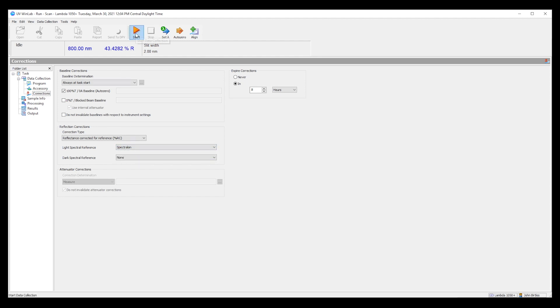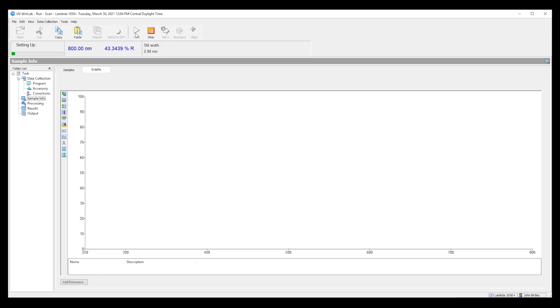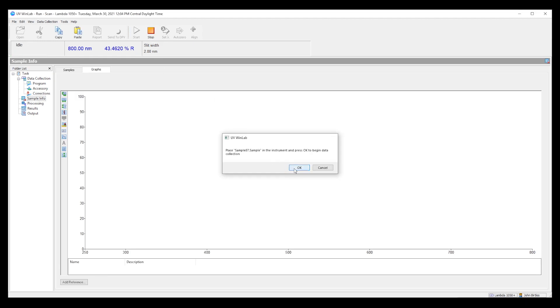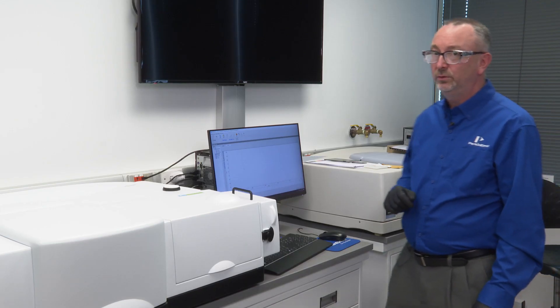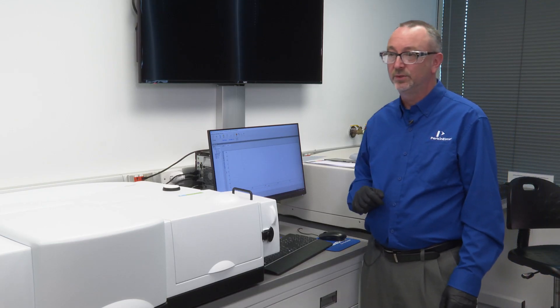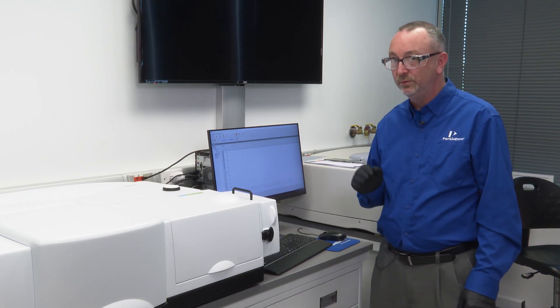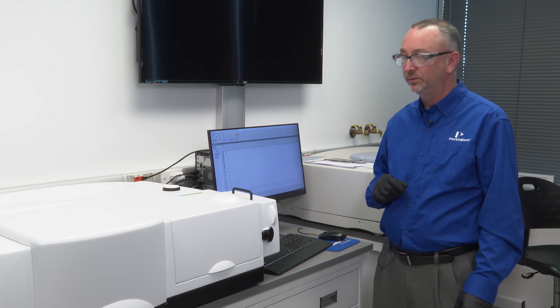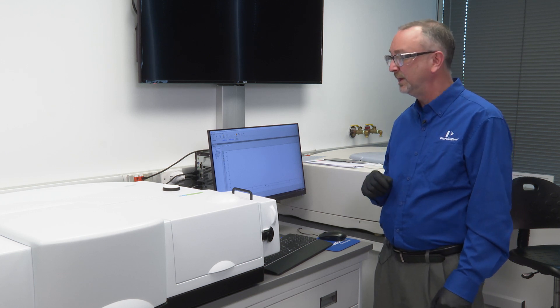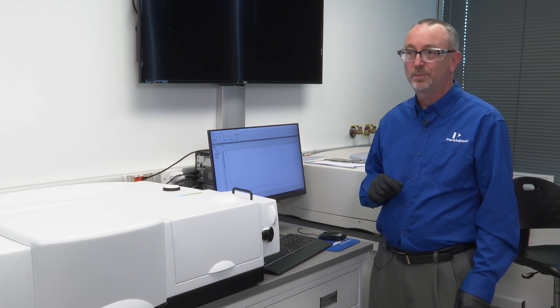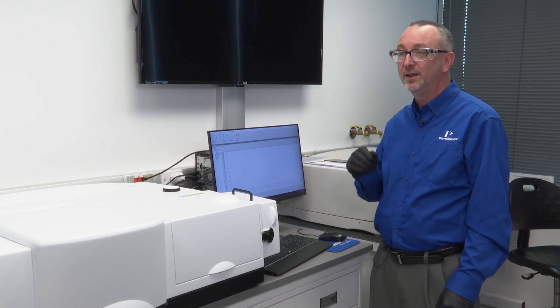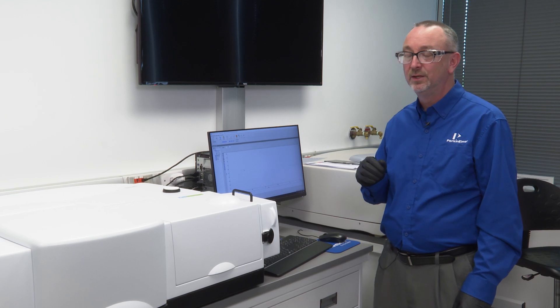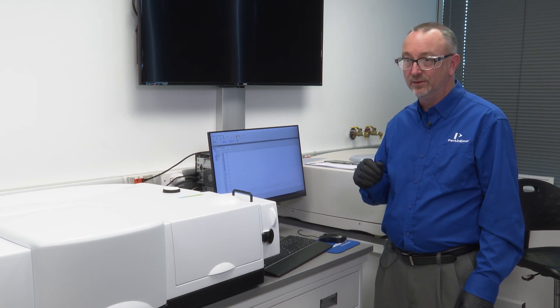Then we press start. We are now collecting the total reflectance of a diffuse material and we are using a Spectralon material as essentially a standard.